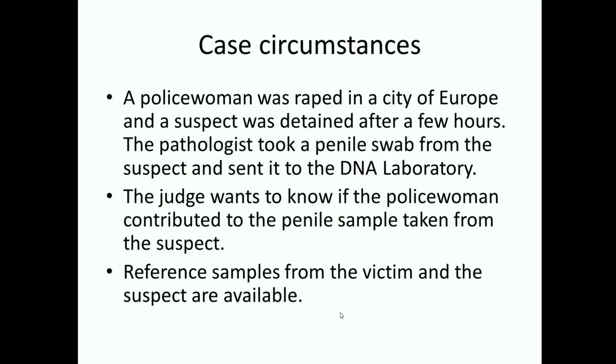A policewoman was raped in a city of Europe and the suspect was detained after a few hours. The pathologist took a penile swab from the suspect and sent it to the DNA laboratory. The judge wants to know if the policewoman contributed to the penile sample taken from the suspect. Reference samples from the victim and the suspect are available for analysis.